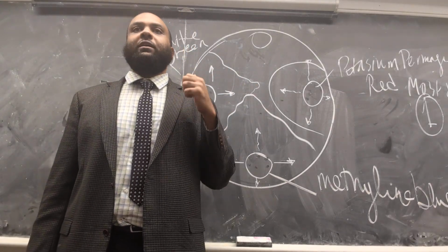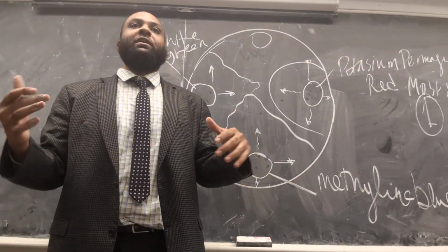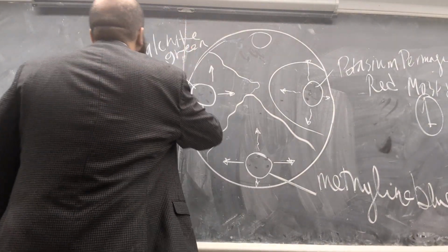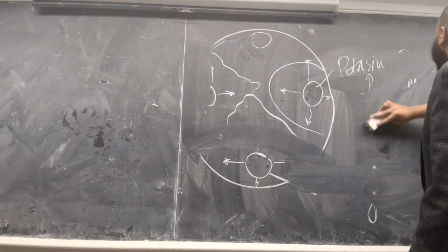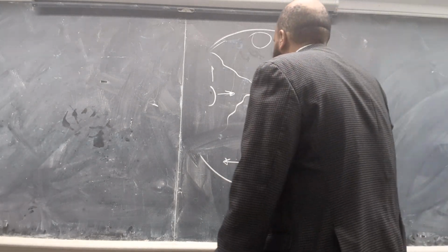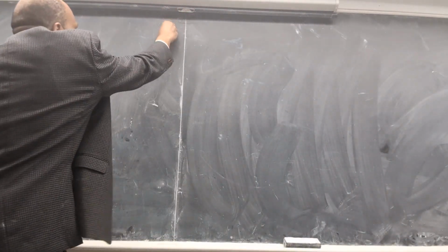So these were all experiments that we were going to do, but we have the equipment to do the next one. Please pay attention, because in the other class they were mixing things up. So what you're going to do now is look at diffusion. You're going to prepare two solutions. Solution number one: obviously you need a solvent.